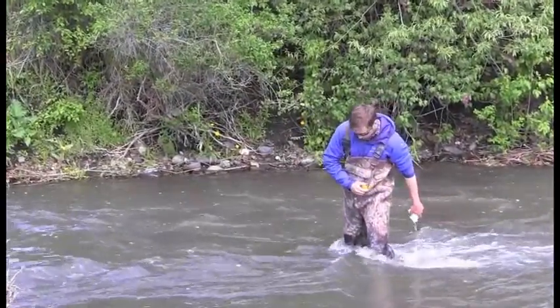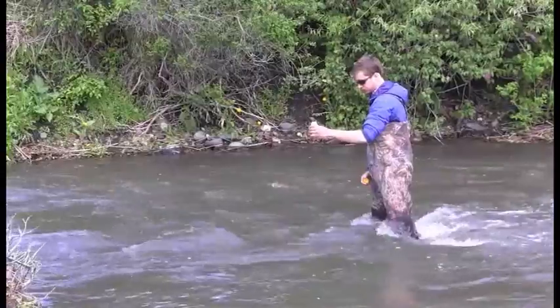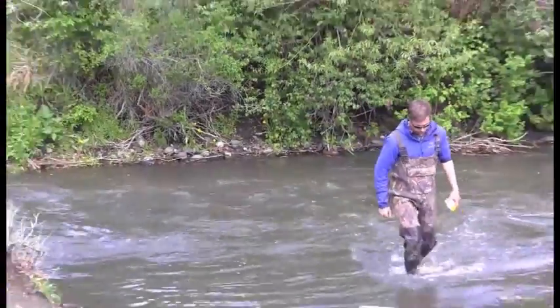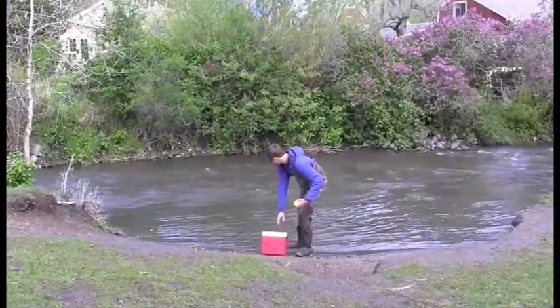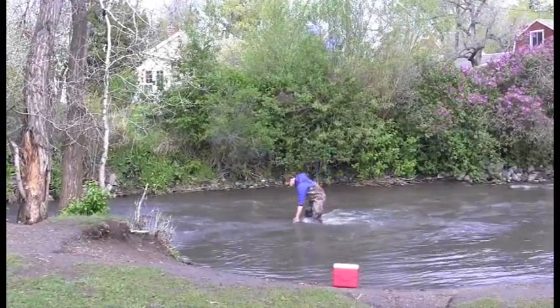Now you can collect the sample. Dip the bottle below the surface and invert it as you bring it towards the surface. Recap the bottle, being careful not to touch the inside of the bottle or the cap. Because we are collecting duplicate samples at this site, we will fill our duplicate bottles at the same location as soon as possible after collecting the original sample. As with all samples, we will triple rinse the bottle before collecting the sample.